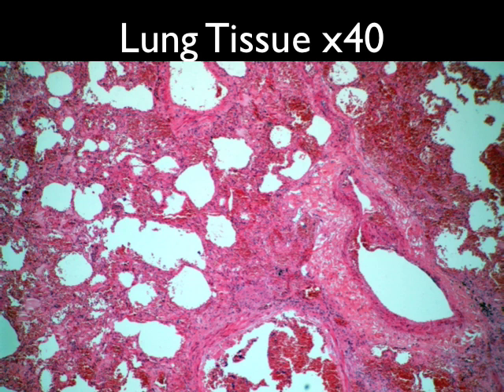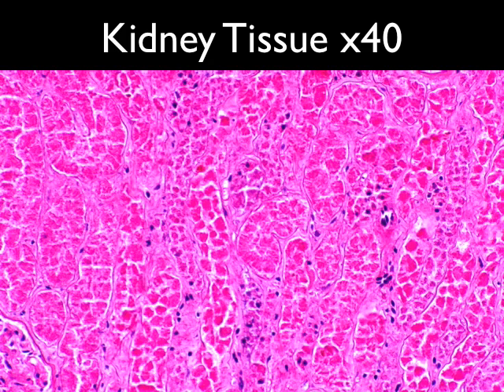All right, so we're pretty good on what we're looking at with those cells, what the nucleus is, there's a cell membrane, why we can't see certain things, how we're sectioning, why we don't see things. That's what I want to get you to. So when you get on the microscopes, it starts to make some sense. Otherwise, you just look at it. You don't know what you're looking at. Right, let's go to the next slide.